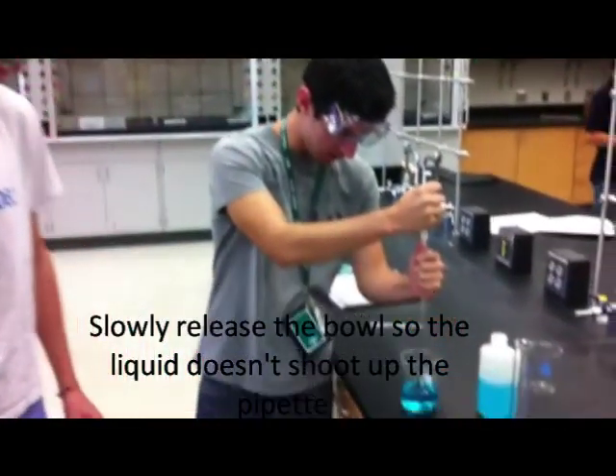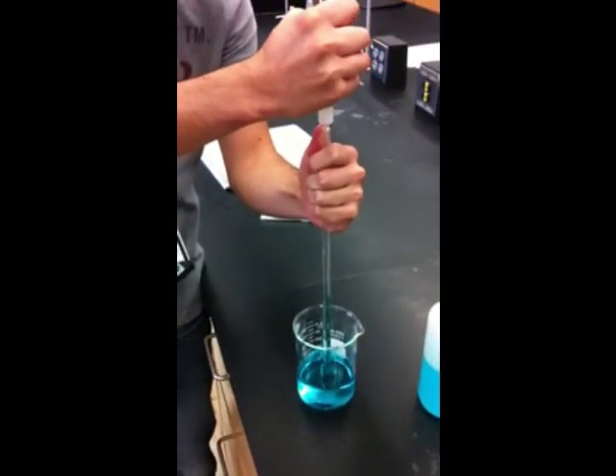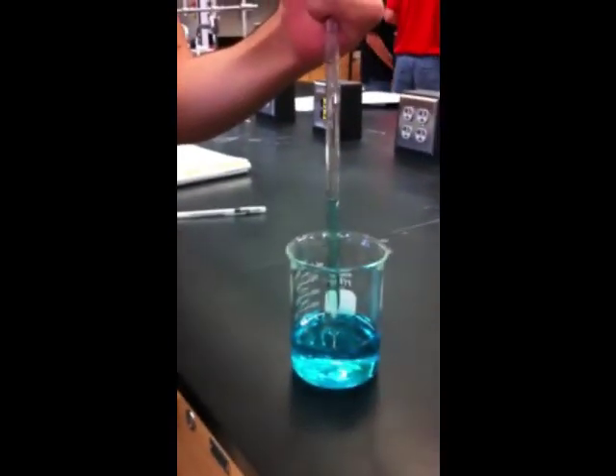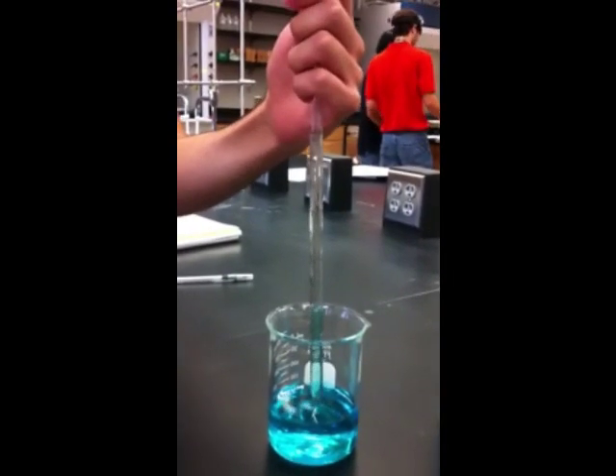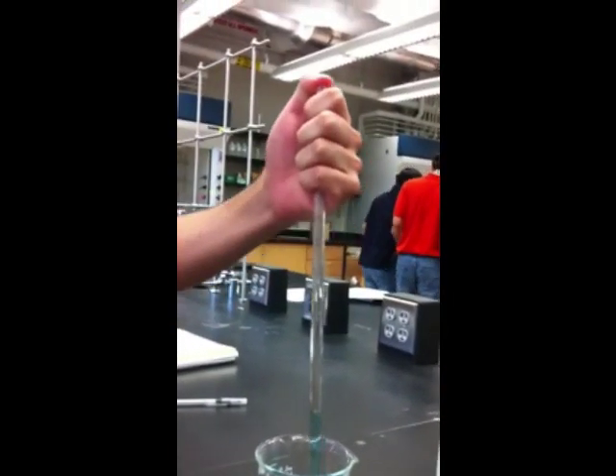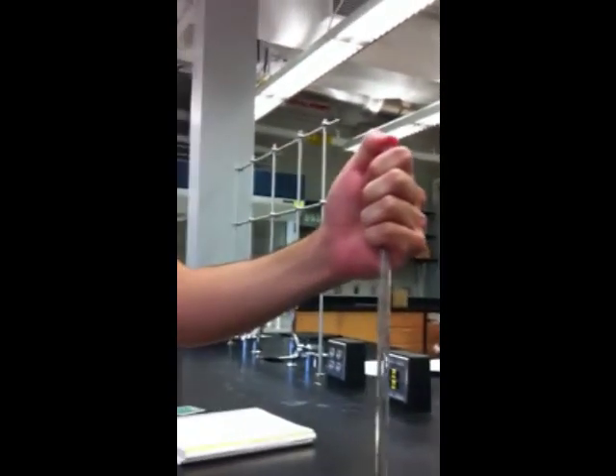So you don't need to fill it up so it doesn't shoot. Make sure it doesn't scratch the bottom. Now you place your thumb on top of it to hold it in place.